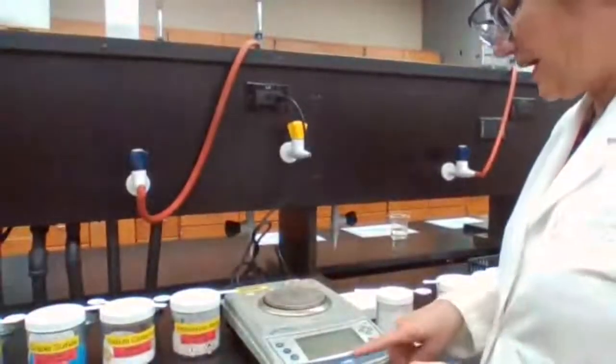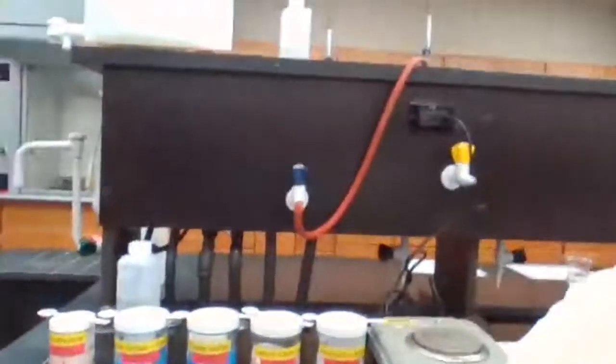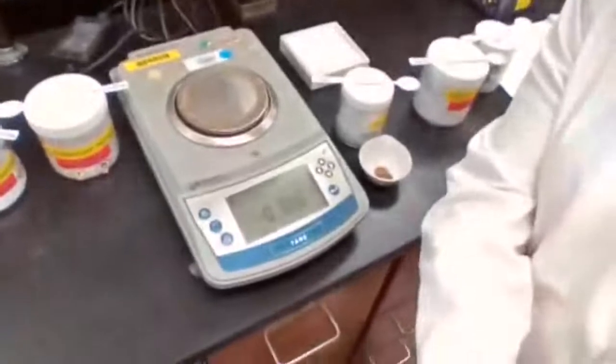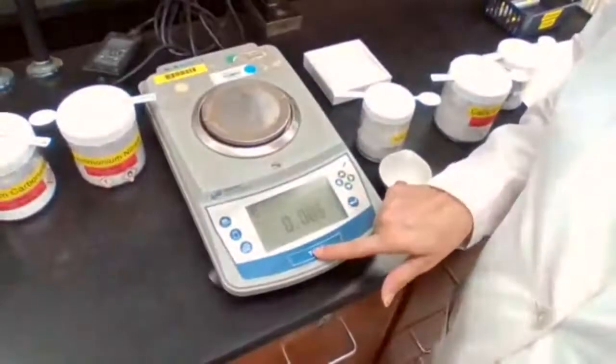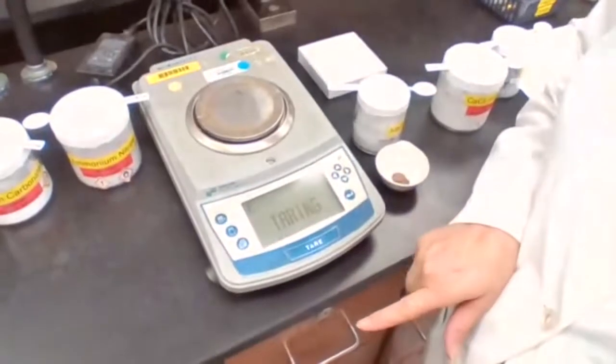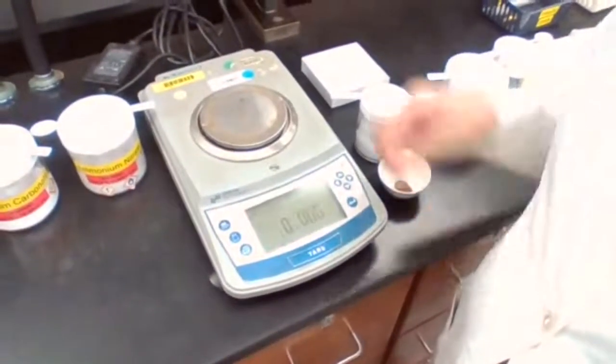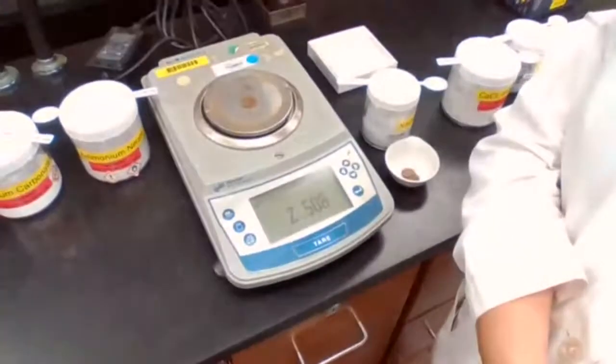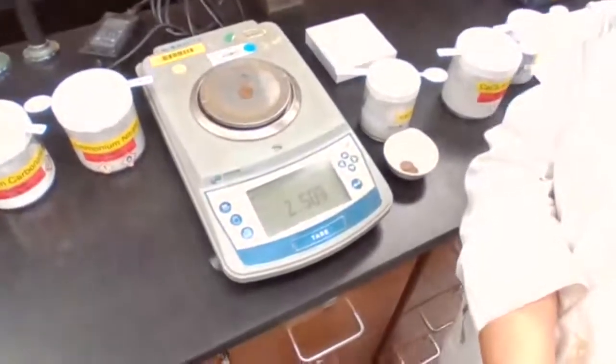Measuring mass directly, you make sure the balance is on. You press the tare button to make sure it's showing 0. Then you place your object on, which is the penny. The mass of the penny is 2.508 grams, and that's what you record as the mass of the penny.